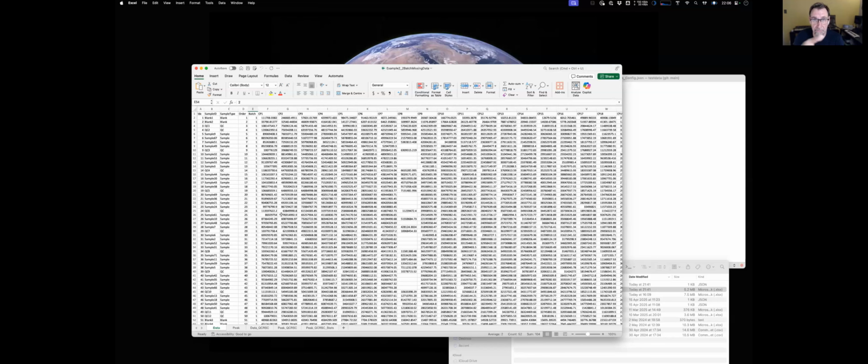The idea is you pool every batch, if you like, or every block of samples as they come into your freezer, as you biobank them. And then at the end of biobanking, you then pool that pool. You get an extra freeze thaw cycle. So that's the negative side. So you're getting the representation of the whole study, but you have an extra freeze thaw. So I would go more with what you've done, which is oversample in the first collection, if you like, and create your pooled QC from that first batch.